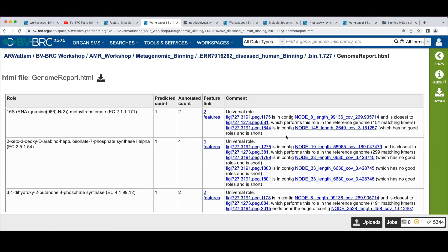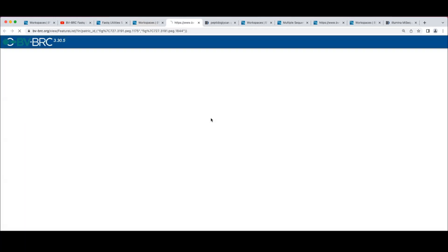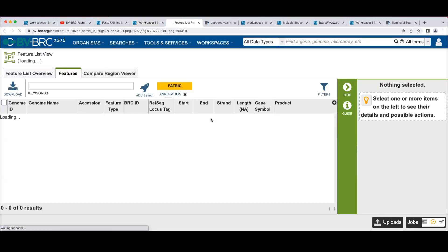So this is a hint that maybe this other contig shouldn't be here. If I click on this two features link, what this is going to do is take us and do a lookup in the database of the features.